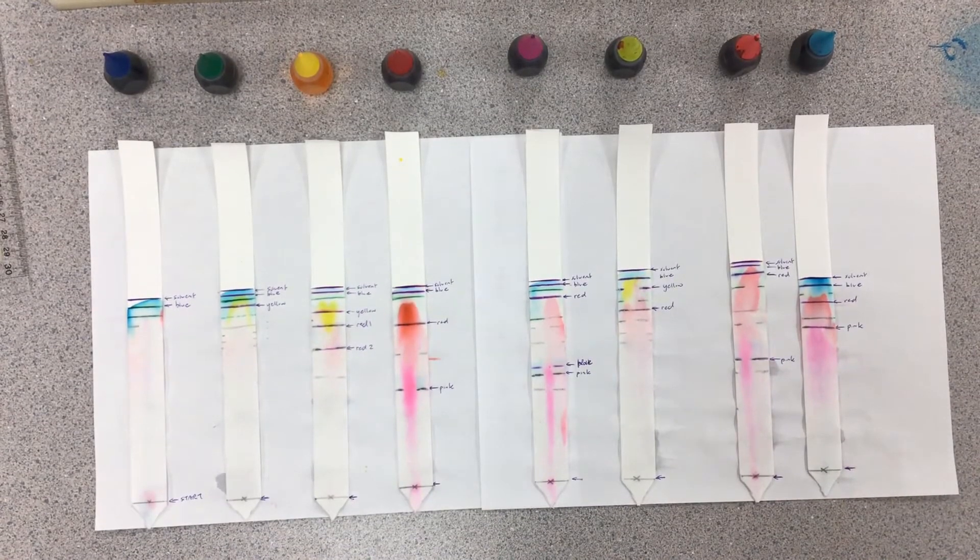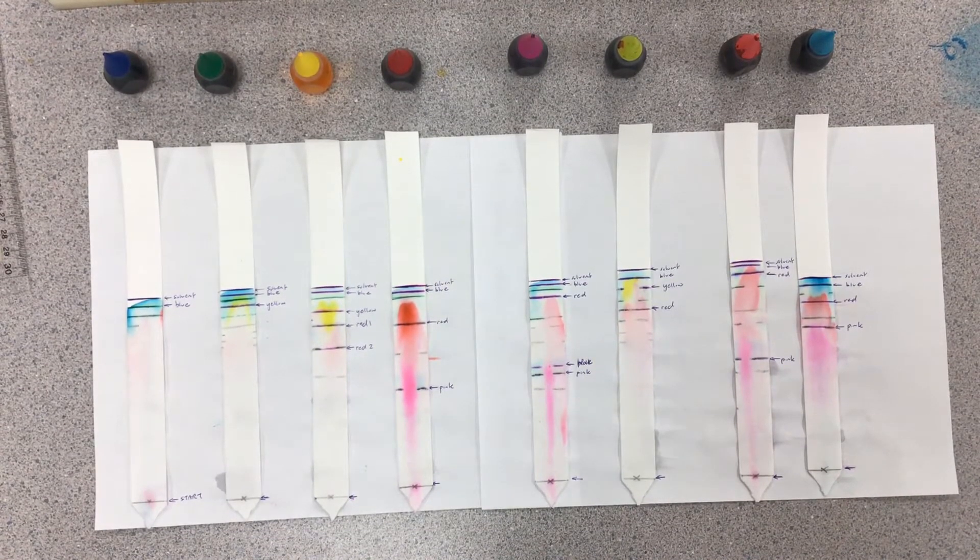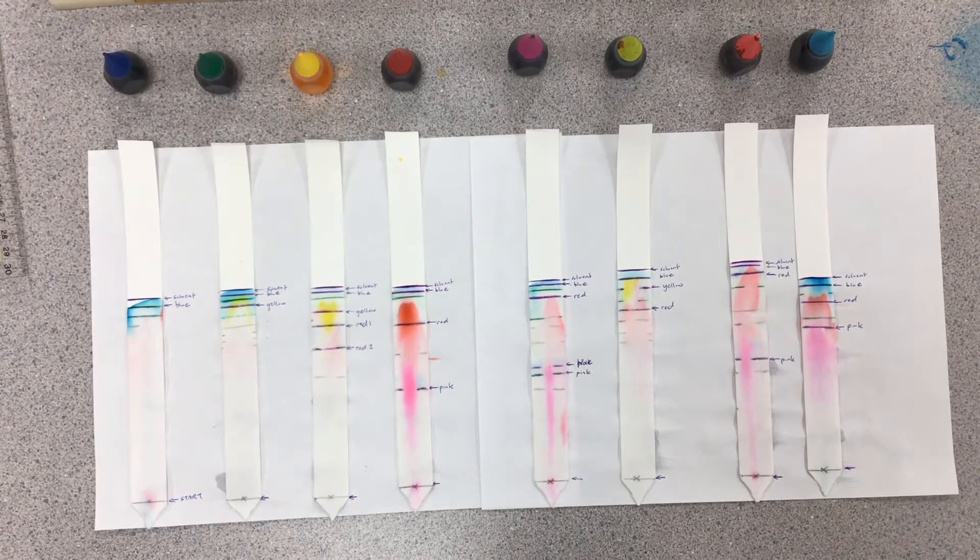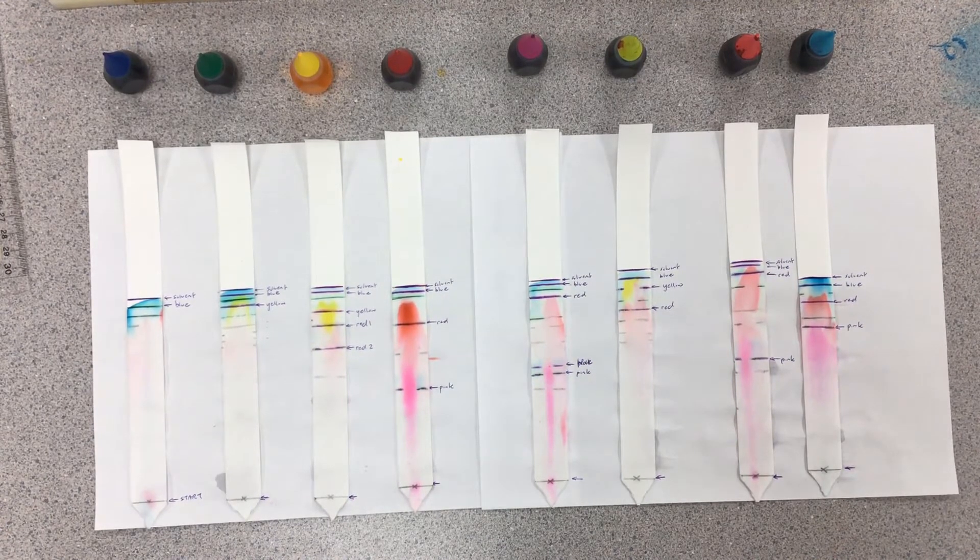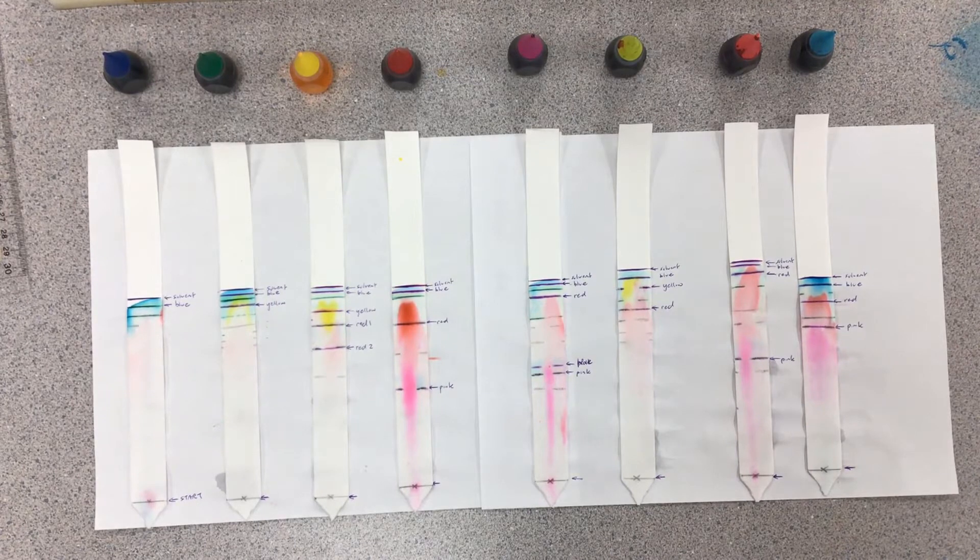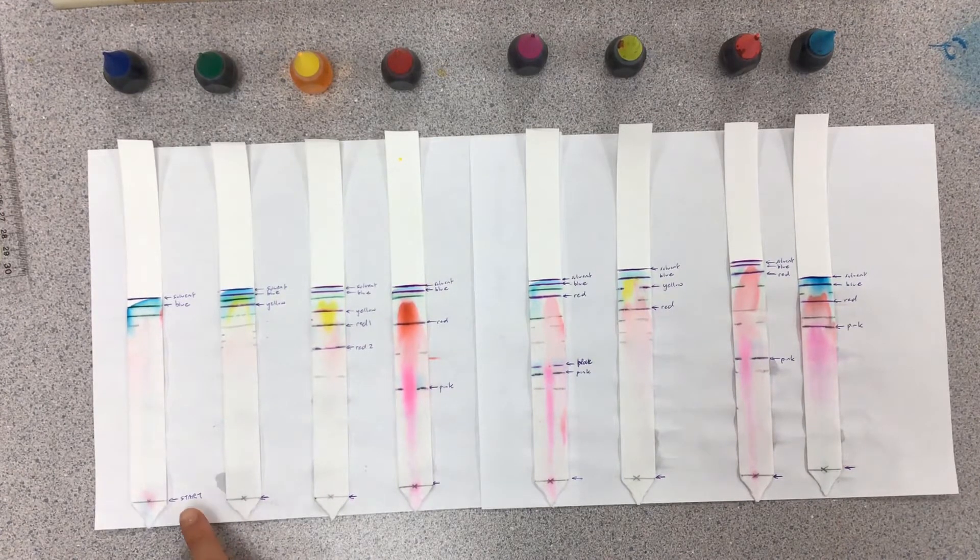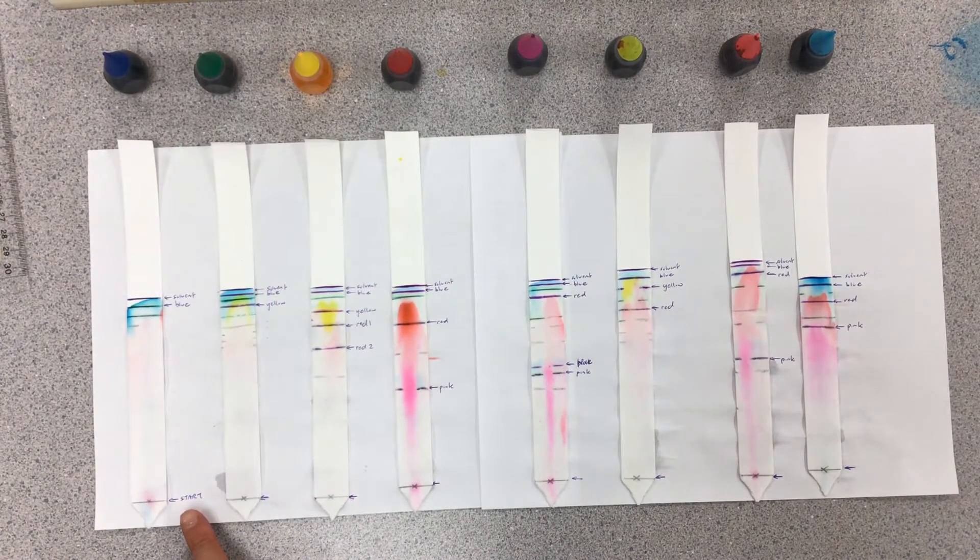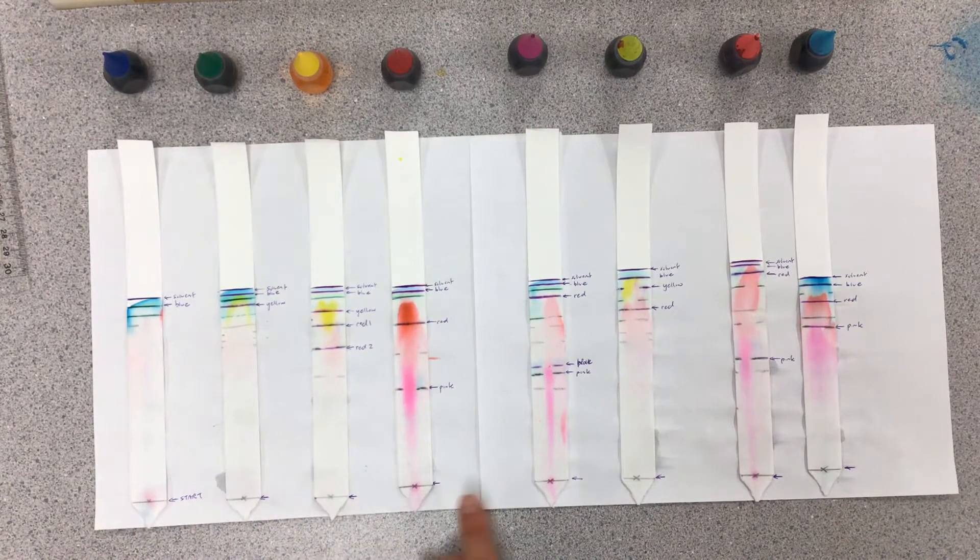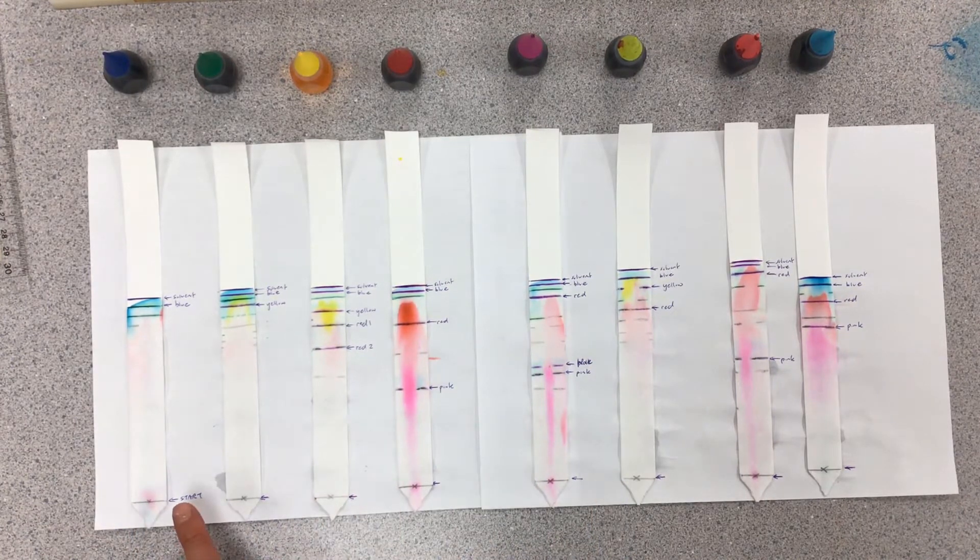Here's a bird's eye view of our results. Our solvent had actually been climbing while I was busy transferring files, so I apologize for all the lines here. I tried to label on the paper itself the marks that we are interested in. All the food coloring dots started out at this beginning line.